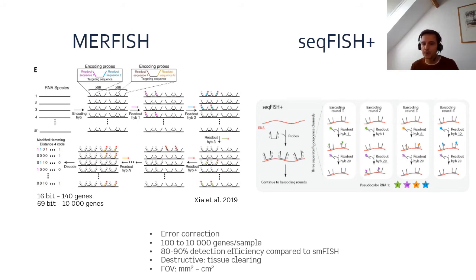But one important thing I want to mention here is these technologies are often destructive, in the sense that you need tissue clearing. You need to remove the proteins from your tissue to be able to use these protocols.